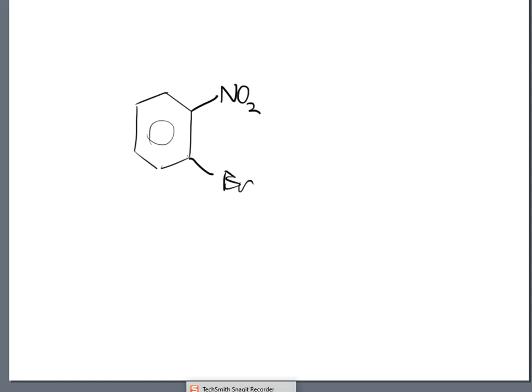Now, what they did not do is draw the other hydrogens on this particular chemical structure. And I'm going to do that just so that we don't forget them. So keep in mind that this circle is actually like a double, single, double type of bond. And it really doesn't matter where they start, actually. It could be here, and then single, and then a double, and then a single, and then a double. But we'll just leave it like this for a minute.